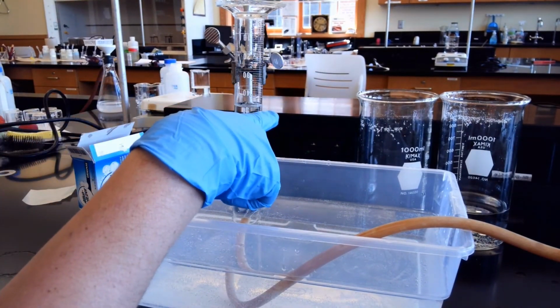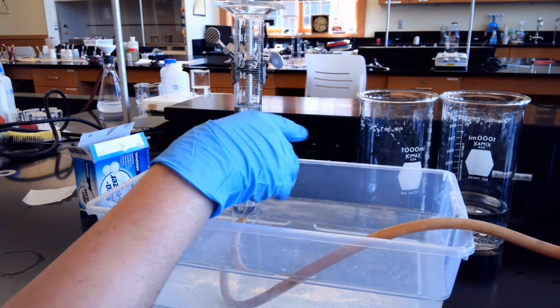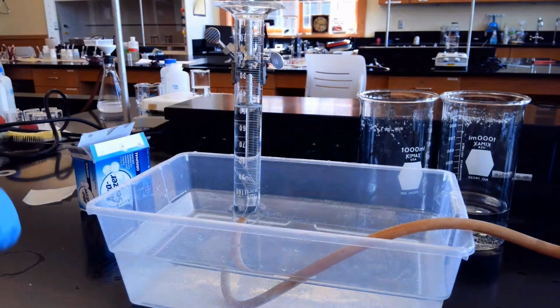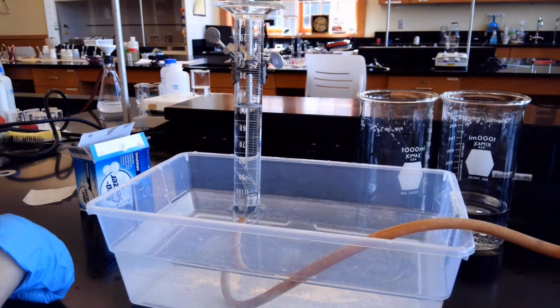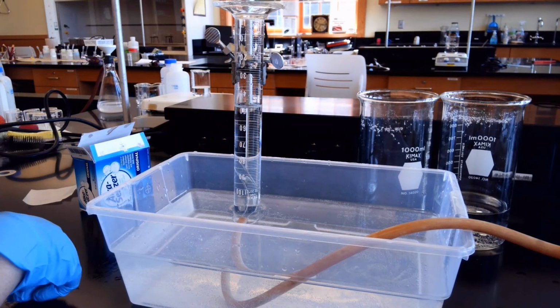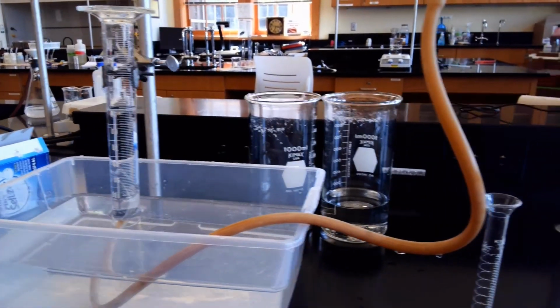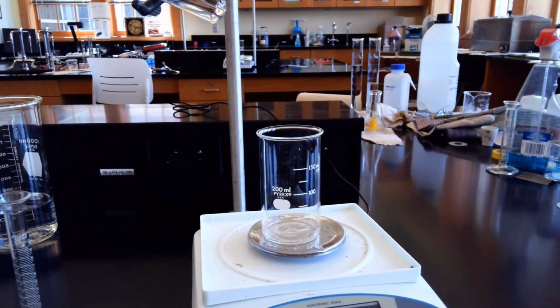But our volume now here is 50. And how about that? We are right on the 50 mark. So 50 milliliters of HCl, not HCl, excuse me, 50 milliliters of CO2 were evolved. 50 milliliters. And the last thing we have to do now is just get the mass of the generator. So we're going to move back over here to the scale.